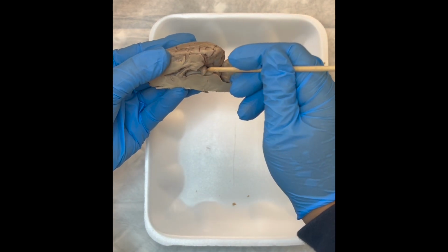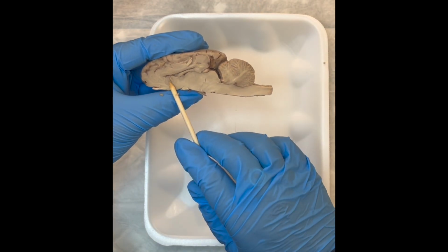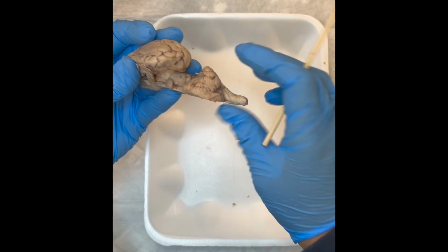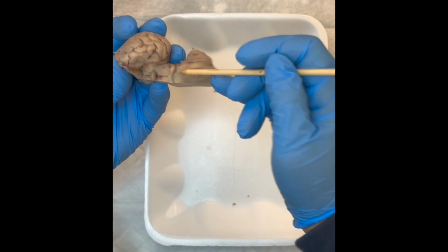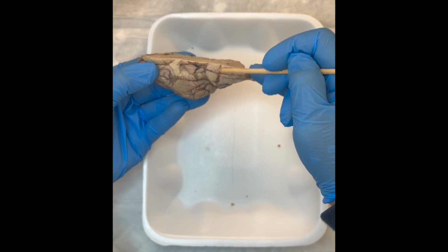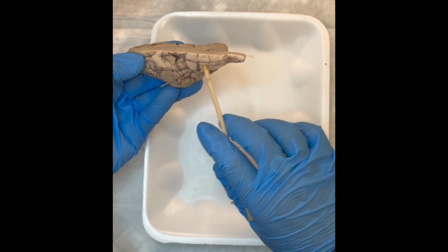I left the pineal gland intact, so that's right there. Again, here we have the thalamus. Then we're getting down to the midbrain structures here, our corpora quadrigemini, so we can see components of that, superior colliculi, inferior colliculi, or you can even flip it like this to help orient yourself as well, because here we have the pons, right? That's the area of the pons, and then the medulla oblongata there.